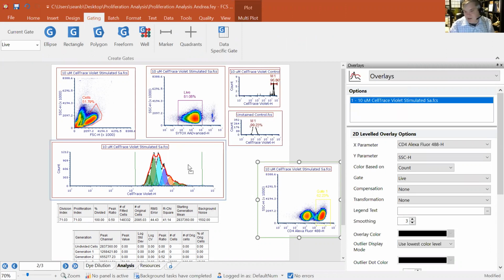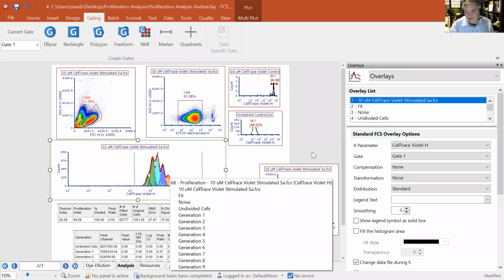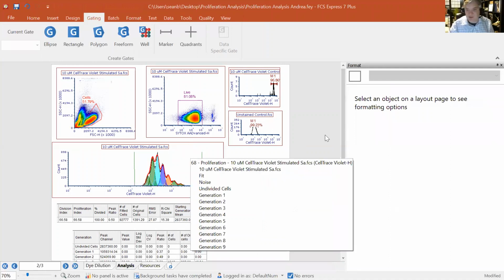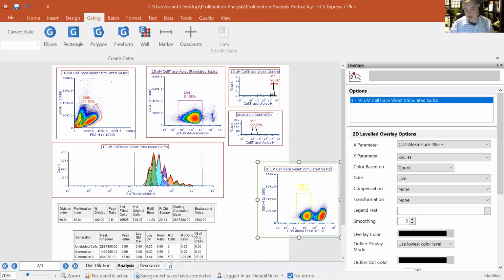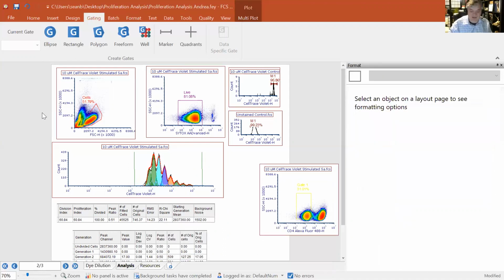And if I need to look at the proliferation statistics for my CD4 positives, when that gate is applied, we're now looking at the proliferation statistics for the CD4 positives. And I could create duplicates of this plot. I can look at CD4 positives versus CD4 negatives. Or if I just move this gate over a little bit for this instance, we're going to see this proliferation plot update. And now we're looking at our proliferation statistics for CD4 negatives, right?